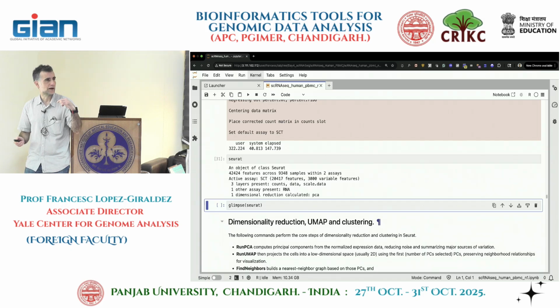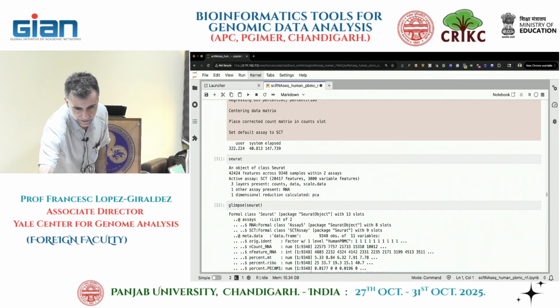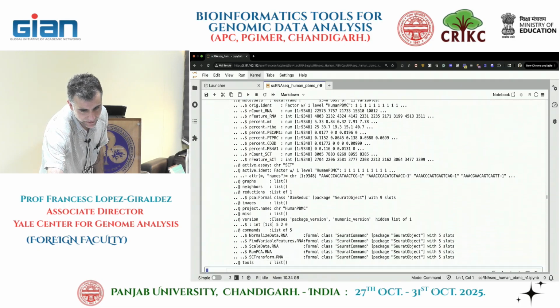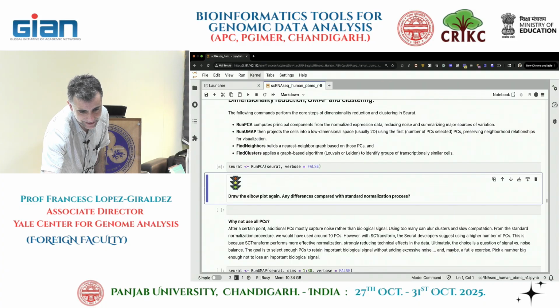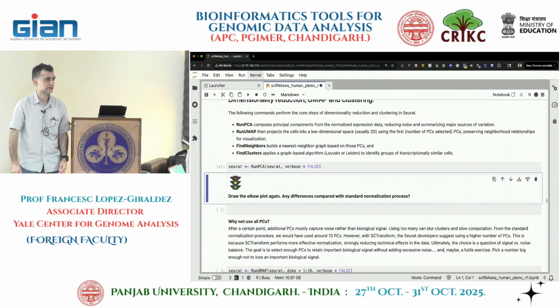It may be that you load some R package that doesn't use what SCT transformation creates, and it uses the expression data, so then you need to be explicit. For now, we're going to leave it active because that works for us. So again, if you want to do the glimpse thing, you can do it. The metadata didn't change. We have a new assay. We need to run the PCA again, sorry guys, because now we are running on the SCT transform data, not the other one.